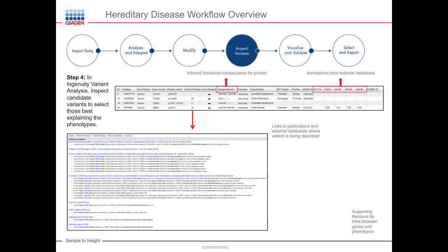It's maybe small, but you can see that here under the column variant findings. Just a moment, I will guide you to this column here. This is actually variant findings in databases and from the literature. So that means this is variant specific.